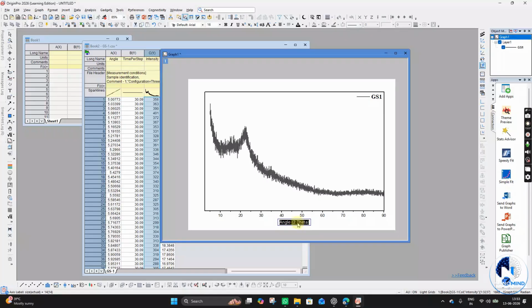So this is enough. And here we need to edit, select all, and here set Times New Roman, and the size is 22, that's important. Okay, overall, anything inside the plot, any fonts, numbers, everything should be maintained at size 22, which is the default. It will be more attractive in your article. And just select all and bold, you can use Ctrl B for bold.